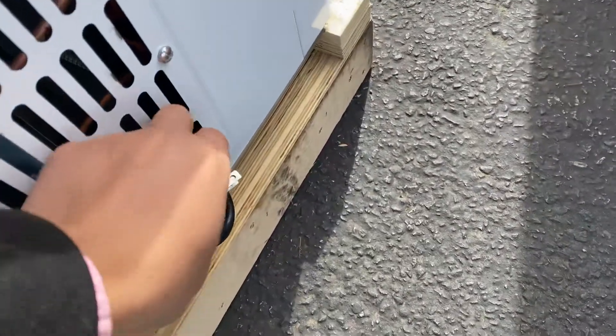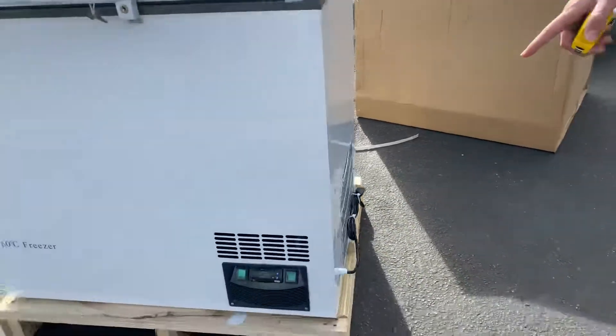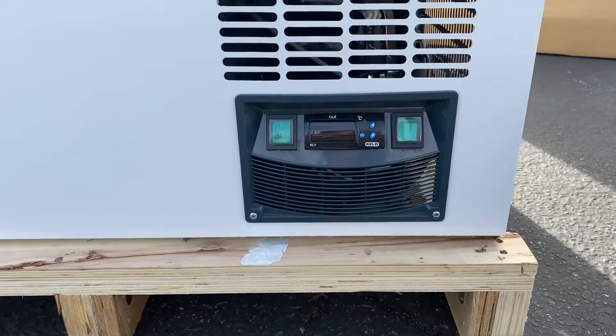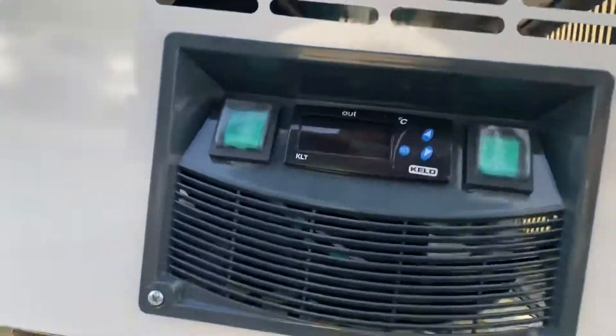The plug is located on the side — it runs on a standard 110-volt US plug. On the front, you have the controls for the freezer: your power switches followed by your temperature panel, which will display the temperature once the unit is on. You can also set your temperature on that panel.